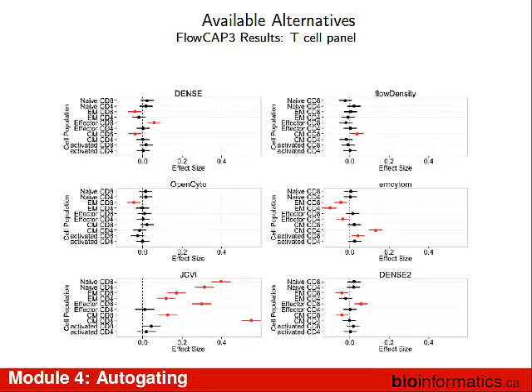The other one was instrumentation. Even if they're coming from the same center, they may have been running different instruments, and that is an effect. So we removed those effects that we knew could be a problem. If you analyze them, you can see there's an effect due to centers, and if you do some views of the data, you can see the data from the same center.